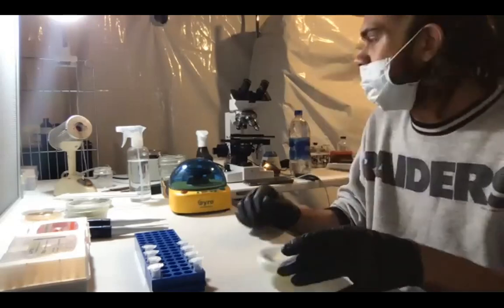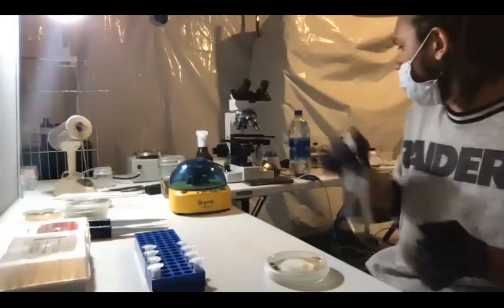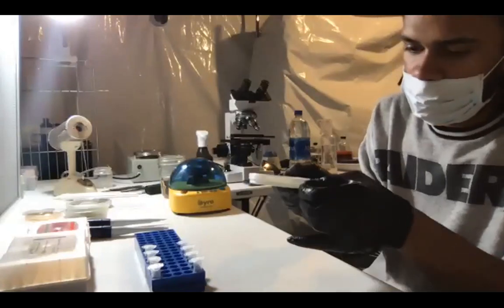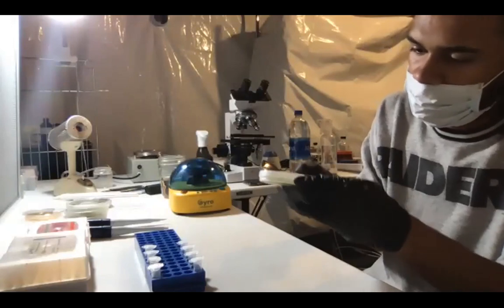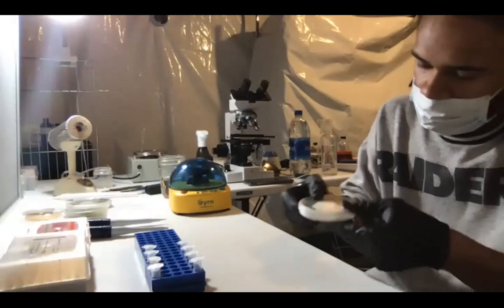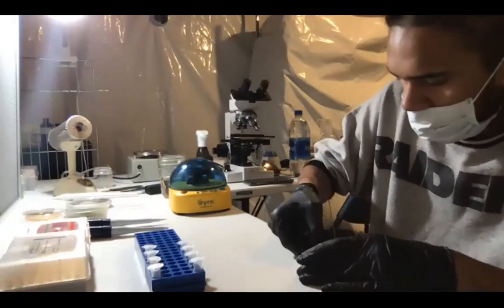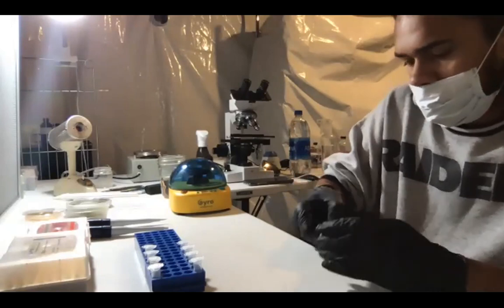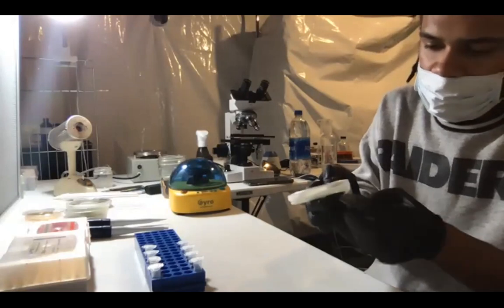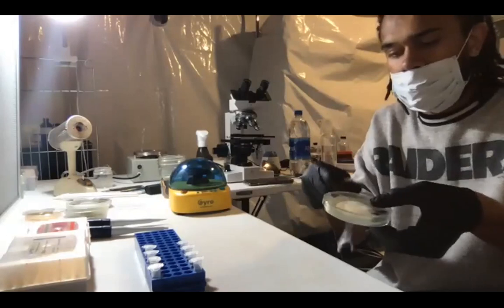So I have my first petri dish here. I'm going to spray the outside with isopropyl alcohol, and I'm going to pull off the parafilm around the outside of it. And just throw this away. There's no sense in reusing it. It'll probably contaminate what you're working with.